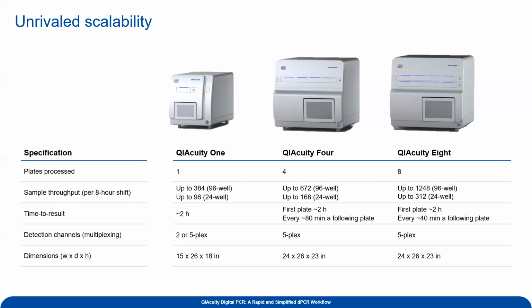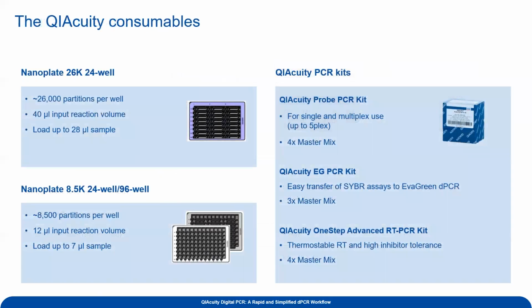And the lab footprint's actually quite small. I'm not going to date myself about how big computers used to be, but it looks like an older computer. It's a little bit larger than that. So that's the system itself.